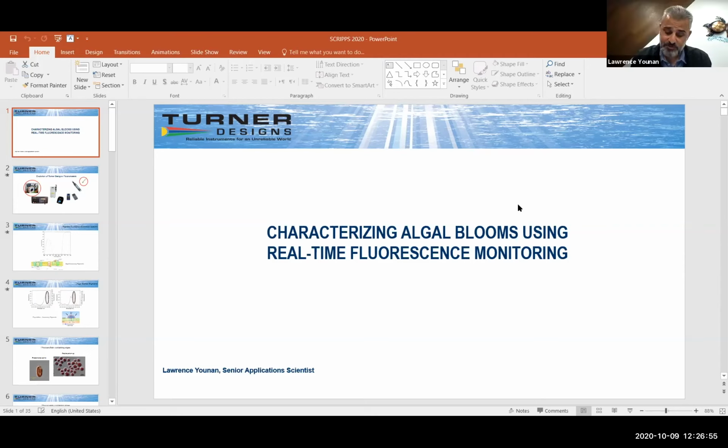Okay, so one of the questions that came in: has this technology been used to determine algal pond infection? No, it has not, but it can detect changes. It doesn't really detect the health of algae. That was one of the questions asked, does it detect the health of algae? But health is more related to active fluorescence. We're talking about specific fluorescence, similar to bulk fluorescence. So we don't do anything with health, but it can detect changes in algal groups on the order of seconds, per second, sorry, is the fastest sampling rate.